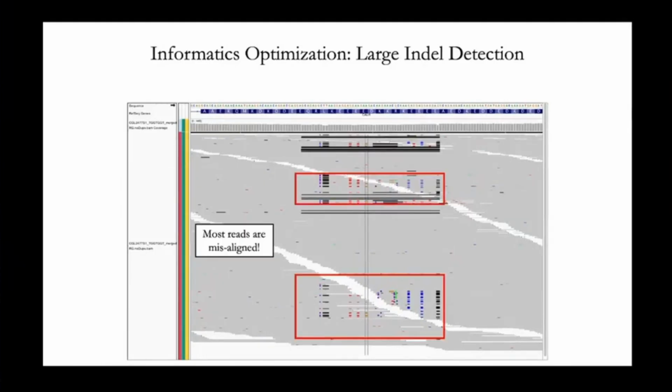We do get a small number of reads with the correct 52 base pair deletion, but most of the reads show truncated weird alignments where the aligner has kind of stupidly been happier with all of these mutations and read clippings than with the actual larger deletion. So if we try variant calling from this BAM file, we're most likely to get tons of individual incorrect mutations, but we may or may not even see our 52 base pair deletion.